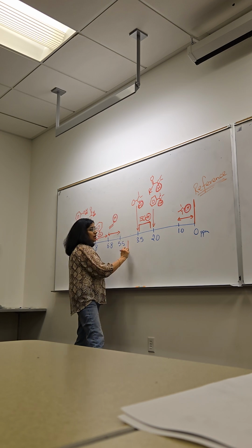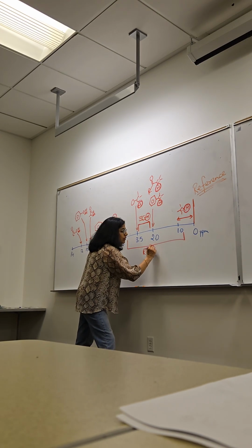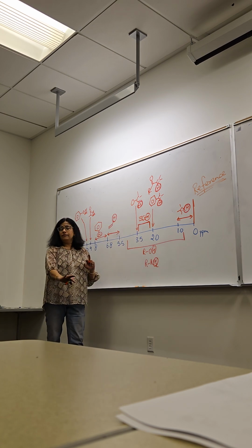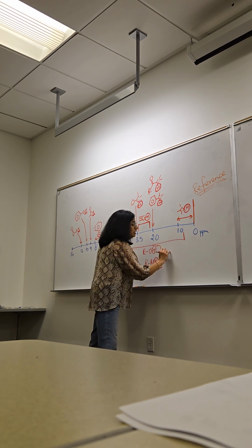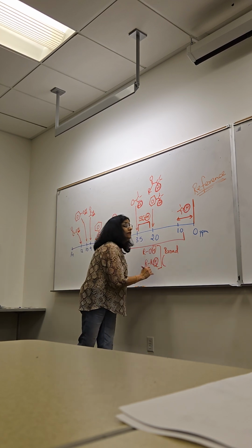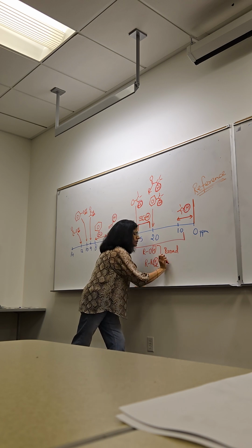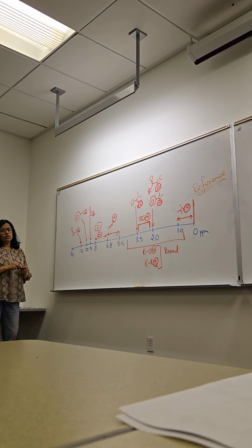Their values can be anywhere in this range. Alcohol OH or amine NH can be anywhere in there. But the good part is they are generally broad, because of hydrogen bonding, and generally speaking they don't show multiplicity because of hydrogen bonding.